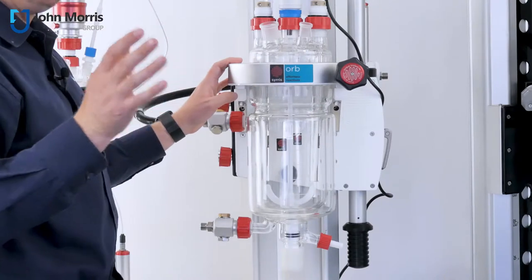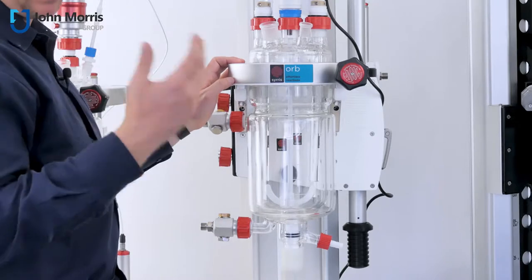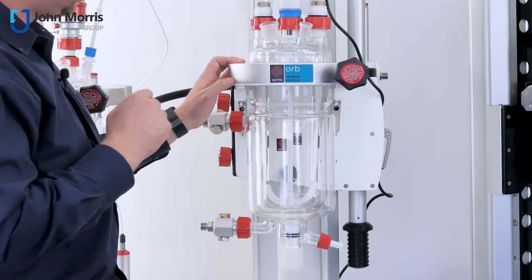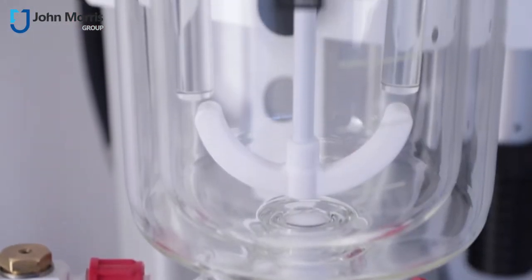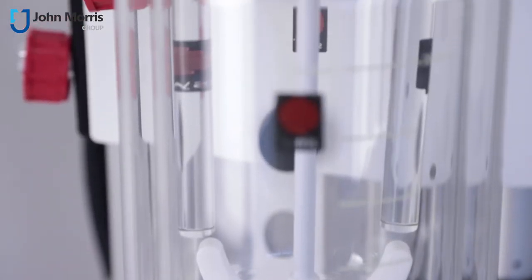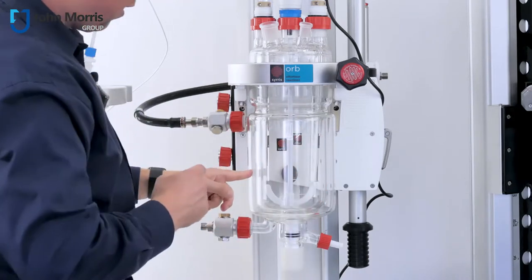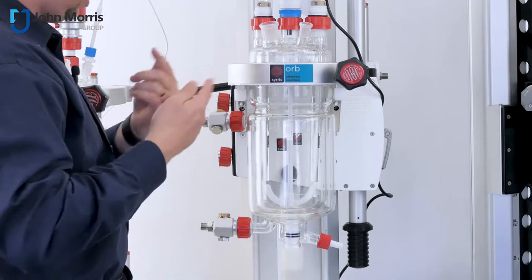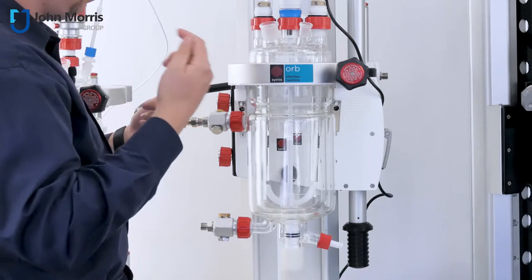At its heart you have the same high quality glass components from Glass Solutions which is a Blacktrace or Cirrus owned organization and you can see here down the middle that we have a stirrer, there's an enormous wide variety of stirrers and you can see coming down the two sides are two glass baffles and that means that you get a very good mixing throughout the entire device and you don't get a vortex, it just stays in the middle.